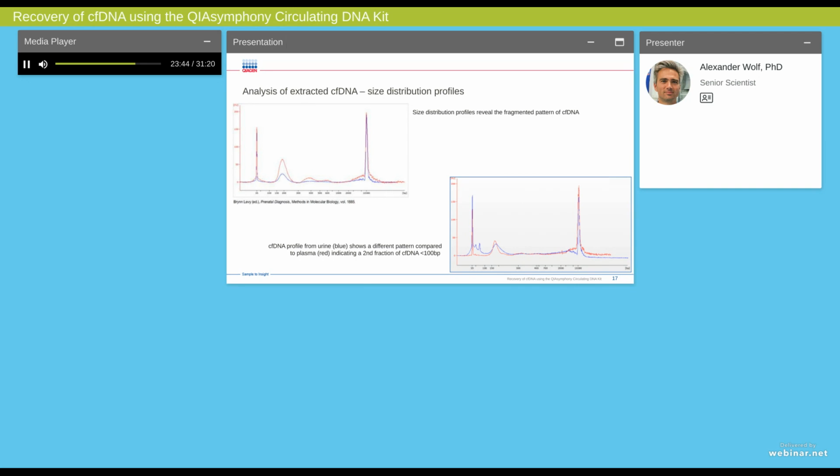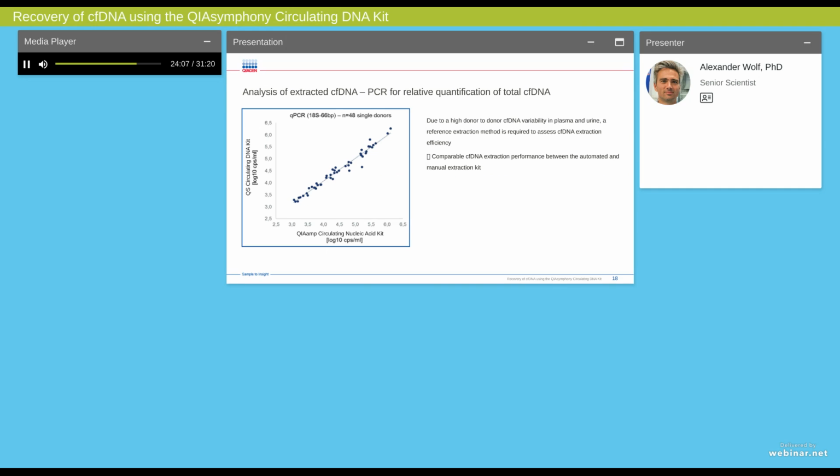Based on our knowledge, working with cell-free DNA from urine is most challenging, mainly due to the high need for stabilization to prevent the release of genomic DNA from cells present in urine, and in parallel to prevent the fast degradation of cell-free DNA in urine, which takes place immediately after sample collection within a few minutes. But usage of a standardized workflow which addresses both issues makes urine an easily and in high volume available and completely non-invasive sample material.